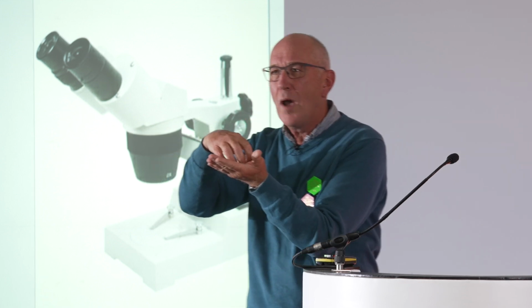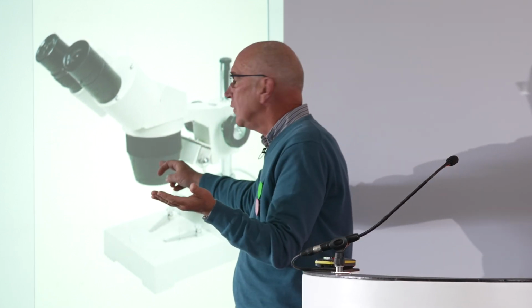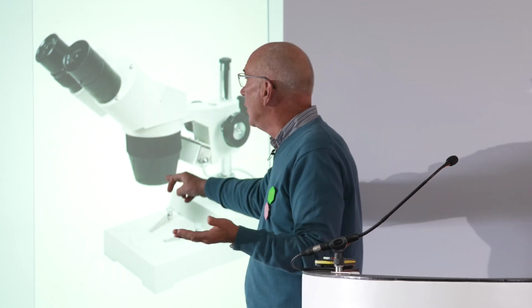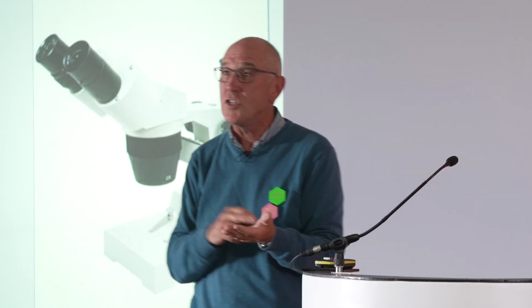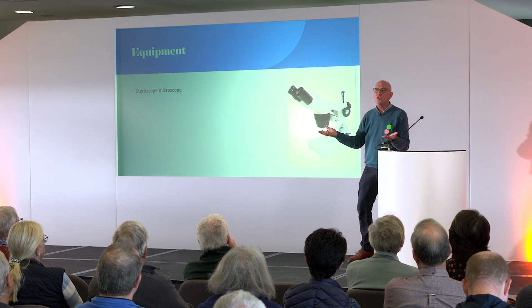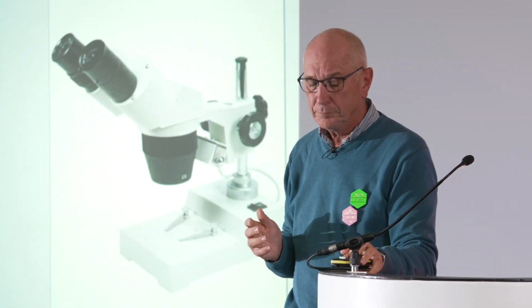And just like binoculars, you have 2 lenses, and you have an eyepiece up here. So you take the magnification down at the bottom, which is ×2 or ×4, and multiply it by the magnification at the top, which is the eyepiece, and that gives you the magnification of that microscope. So all we need is ×20. These are normally ×10 and ×2. That's ×20 magnification. ×10 ×4 is 40 times magnification, and that's good enough for anything we want to do in anatomy, and for when we're doing things to dissect. Some people call this a dissecting microscope because all we wanted to do is dissect and cut up our bits to prepare our slides or whatever we were going to do.